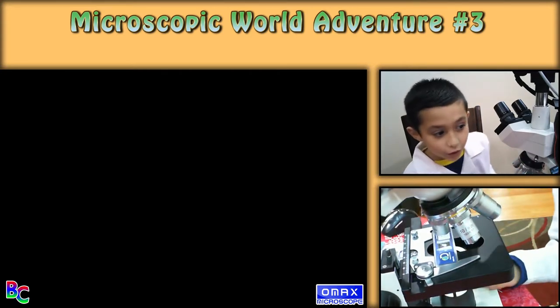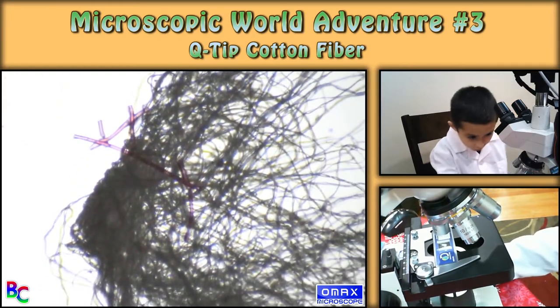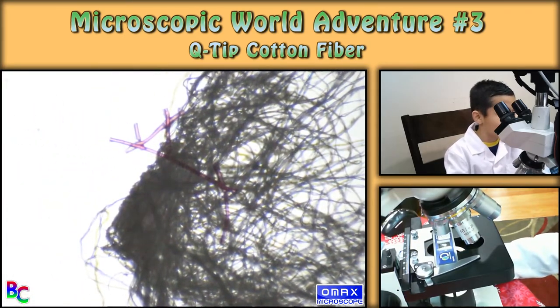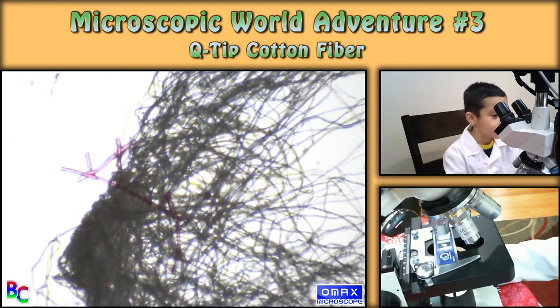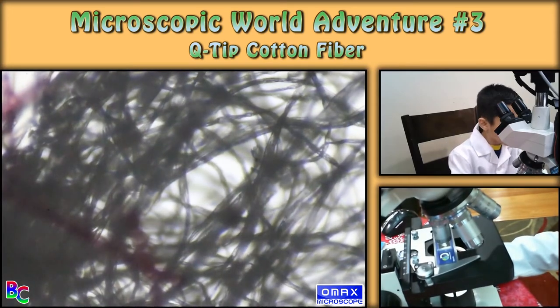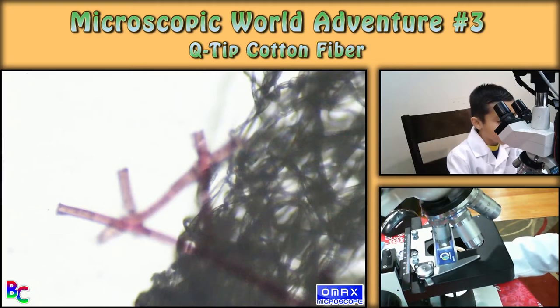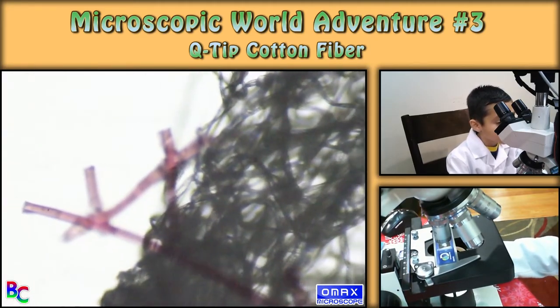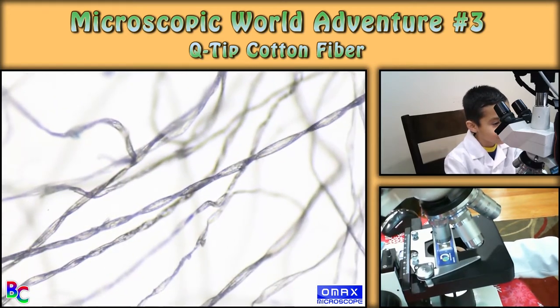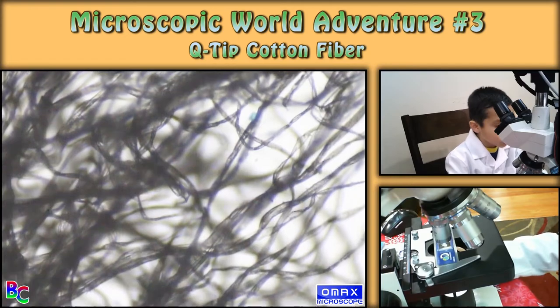Let's get started. So my dad and I put a little ink on this one. This is the q-tip cotton fiber — it has strings. I'm gonna zoom up. My dad made these so I don't know most of them because I did not look. I'm gonna zoom up... whoa. It looks bigger, maybe straight fibers from something else, but I think it's the same fiber just colored. It looks like webs.